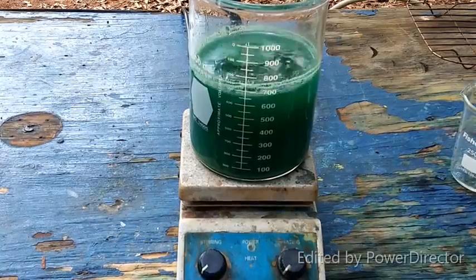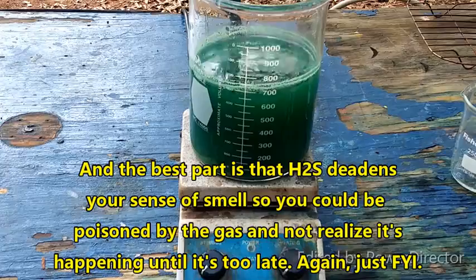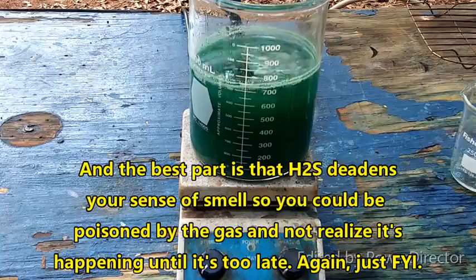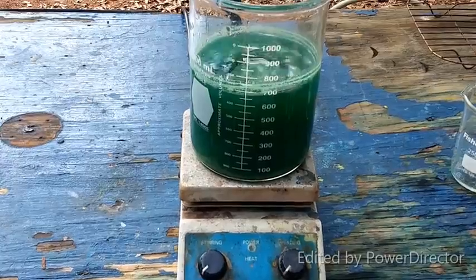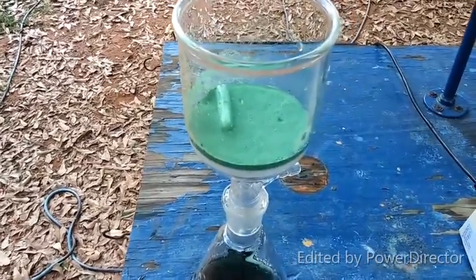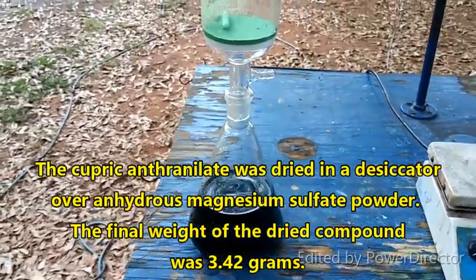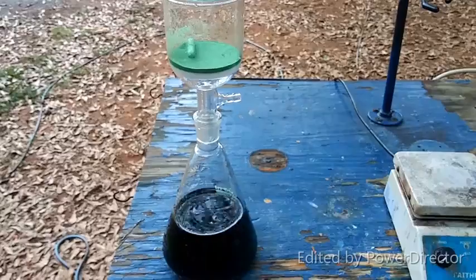Obviously, hydrogen sulfide is really, really poisonous, so another thing to think about when you're doing this at home, make sure that you don't kill yourself on the hydrogen sulfide when you're working with it. So, anyway, good advice for a happy life. Okay, I guess there wasn't as much copper anthranilate as I thought there was. Well, now you know.